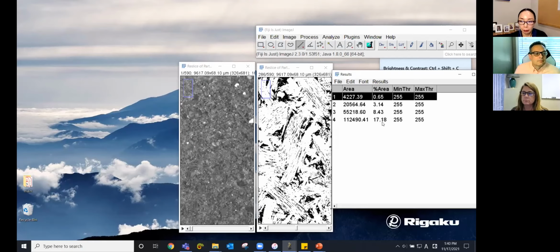But if you're thinking about an industrial, let's say metrology, dimensional analysis version of ImageJ, I am not aware of it, but I would not be surprised if somebody makes a plugin that does metrology dimensional analysis within ImageJ. That sounds like a reasonable thing to do. So Don, if that wasn't exactly what you meant, go ahead and type in a follow-up, and we can answer that question more clearly.